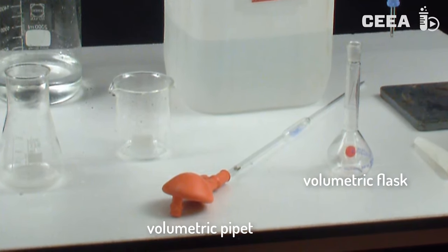An accurate volume of the original sample is taken with a volumetric pipette, brought into a volumetric flask and diluted with water.